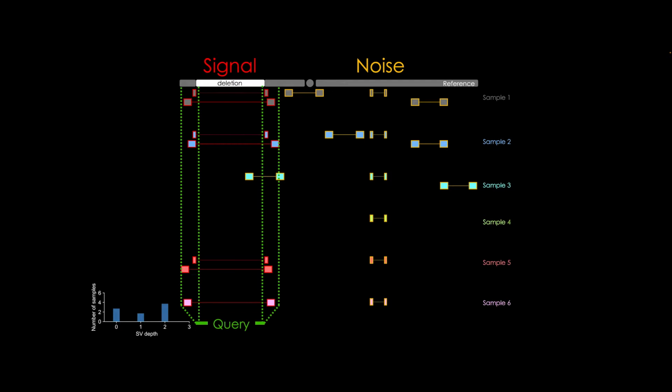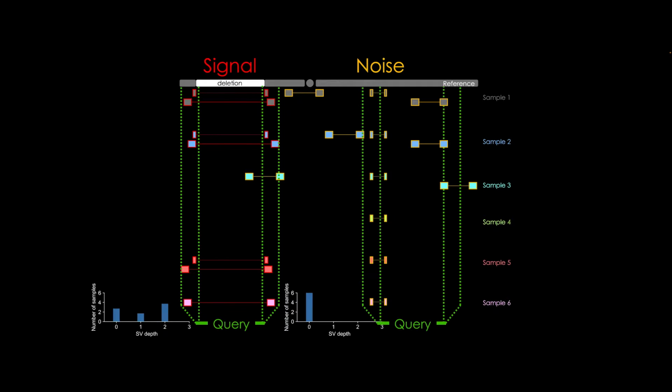For this query, for example, we see that there is evidence in multiple samples and interpret that the variant exists in the population, whereas another query finds no evidence supporting the existence of that variant in this population. While we don't get rid of the false negative issue altogether, I argue that we drive it to the sensitivity of the data. Had we sequenced more, we might have picked up evidence of that variant.